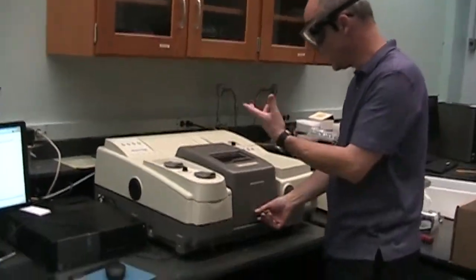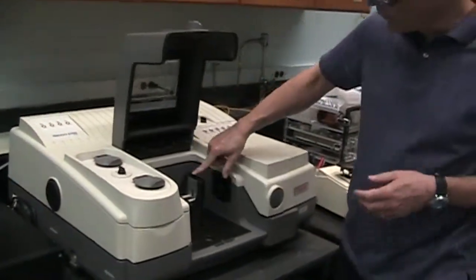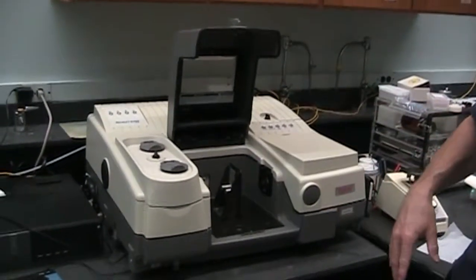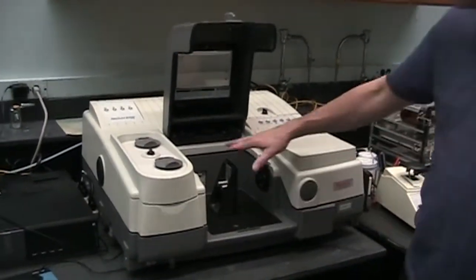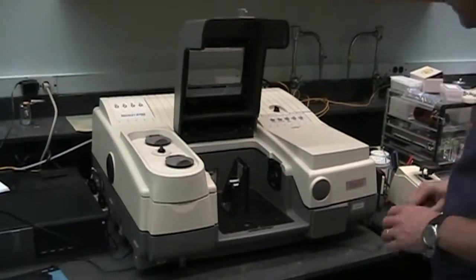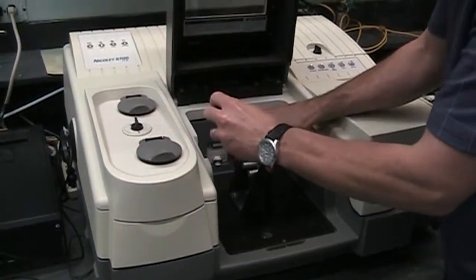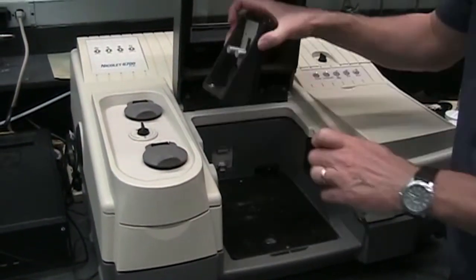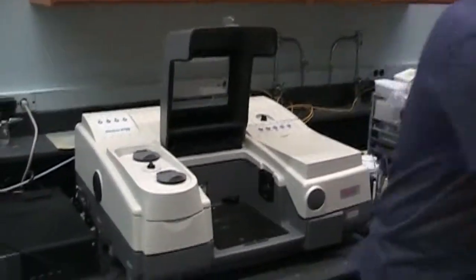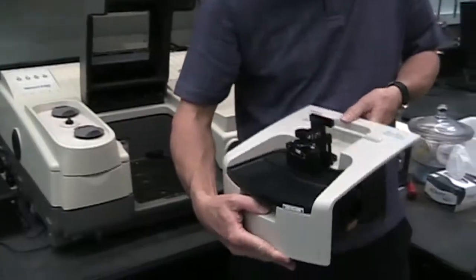Accessory first. So depending on how you find the instrument, but in this case, the sample holder is in place. We're going to remove it, and then we'll put it back in place here in a little bit. But if you want to do the ATR, we need to remove this. Usually you should be able to find the screwdriver around. It's basically just removing these two screws that are holding the sample holder in place. This is the ATR accessory that we'll be using.